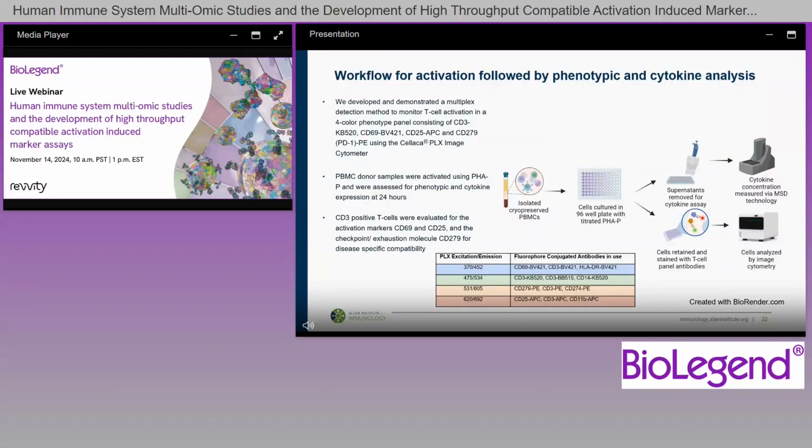Below, we have added the fluors that we have tested and are using, which we have sourced our antibodies from BioLegend. However, if you have any questions, Revvity likely has suggestions that you can use. We have chosen these conjugations in our panel because they are cataloged and ready to purchase. They are less expensive than custom conjugations or tandem dyes, and that was and will be a factor for how we develop assays for this instrument in the future.